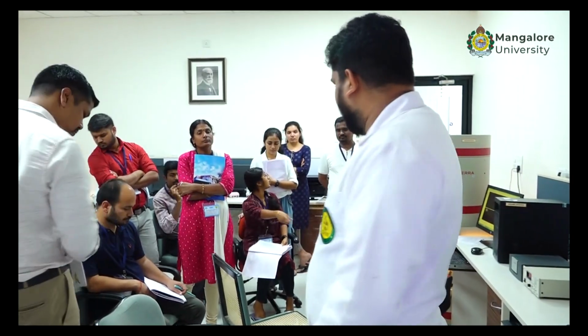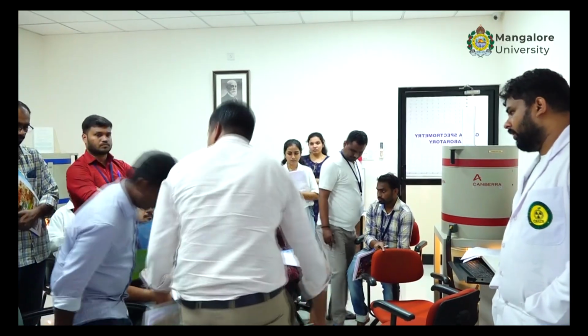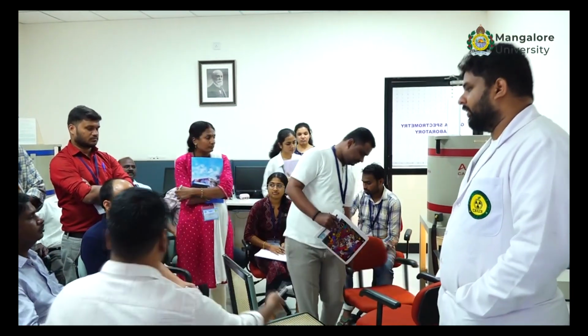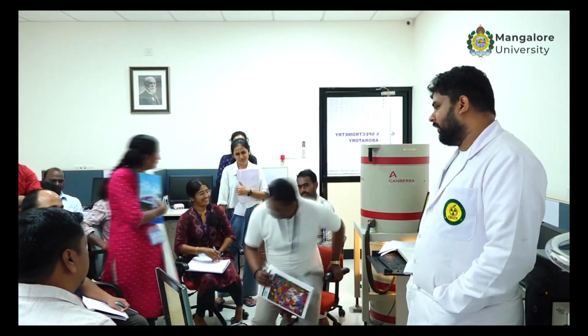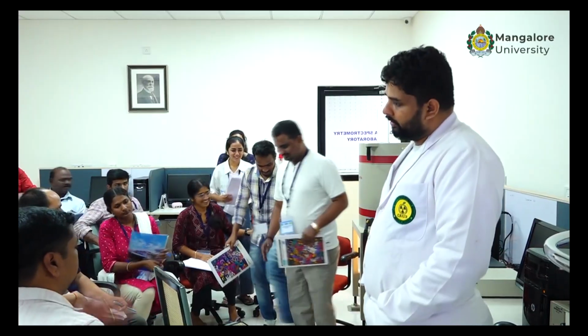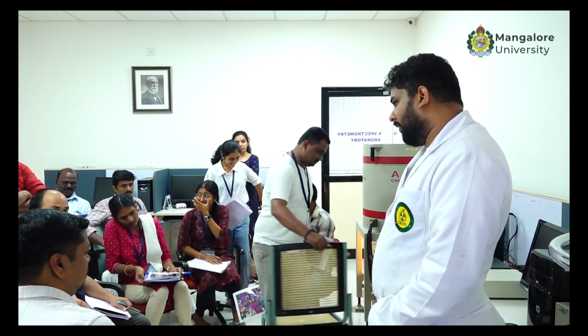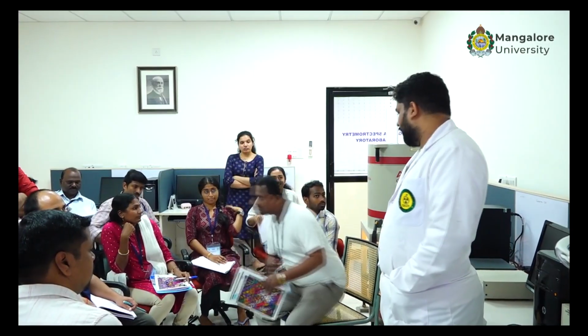Then we have an exercise for you. As sir discussed, we have got some samples from the International Atomic Energy Agency for the intercomparison exercise. This exercise is held yearly. Every year they send us samples and we give them results, and only if our results are acceptable can we say that our results are valid. This is held with 300 plus labs around the world.